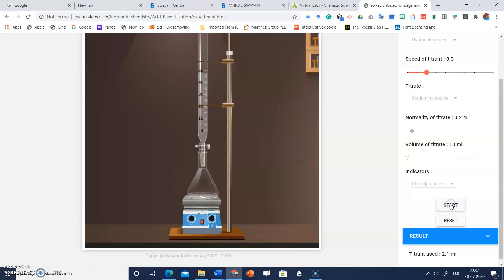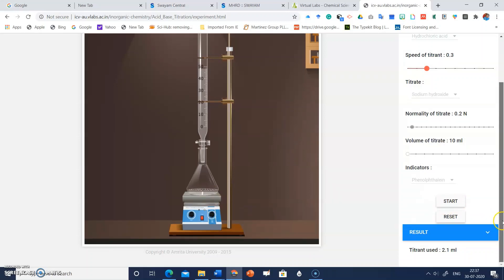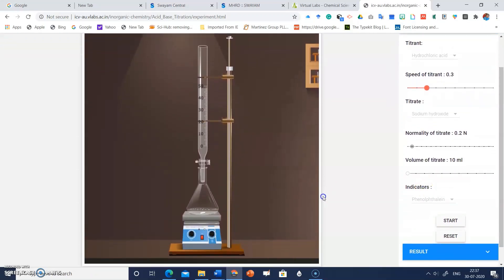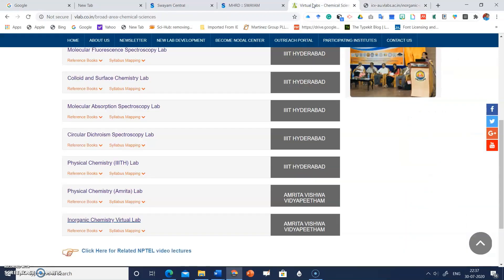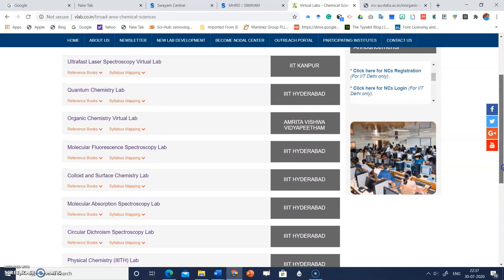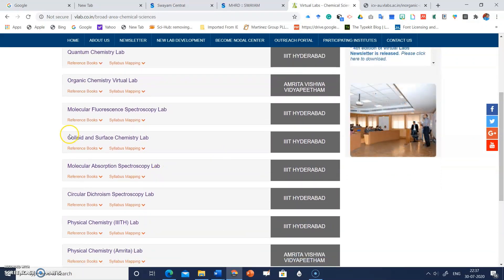Stop the experiment when the pink color disappears and note the result — the volume of titrant used is 2.1 ml. You can share these virtual lab links with your students to perform virtual experiments on these platforms.